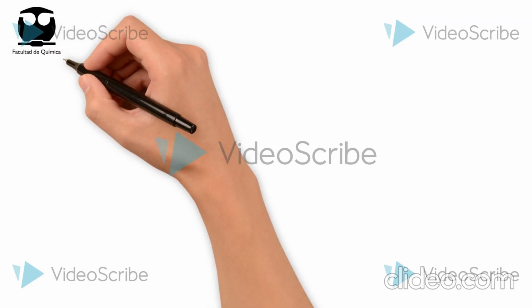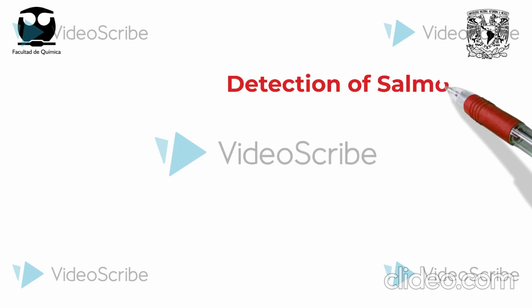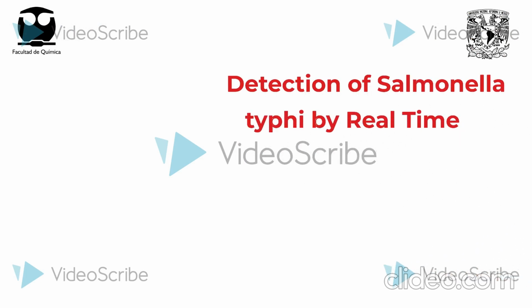Today, we will explore how real-time PCR helps us detect Salmonella typhi, the bacterium responsible for typhoid fever.